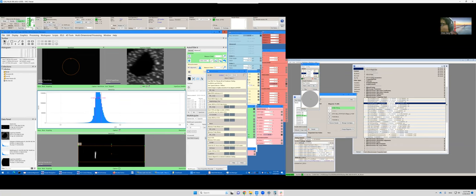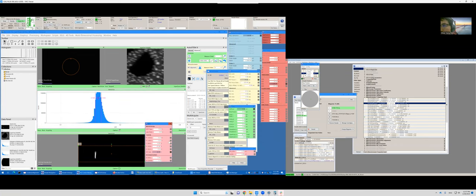So this is good. And then we start to play with this panel, which is the EELS tuning panel. We can play with FY. And make sure this feature is vertically being shown in the line feature. And then we can play with the C to correct the C shape. And then finally, we want to move the peak to zero by using this ZLP tag. So we can left click and use the left and right arrow on the keyboard to move this peak to the position.